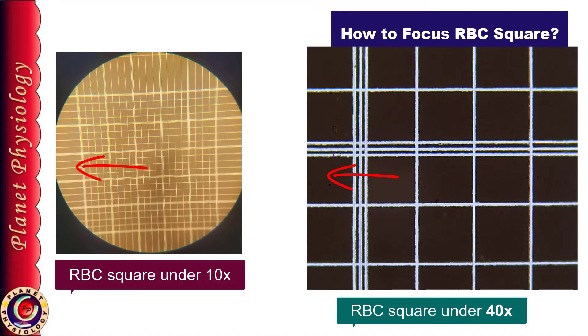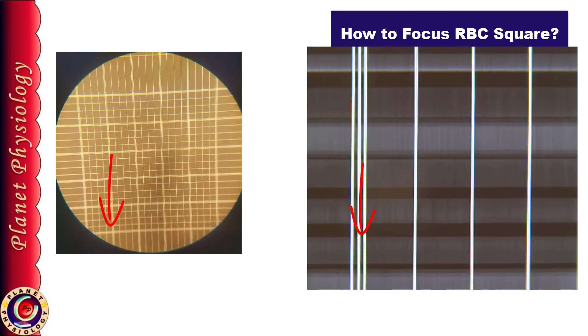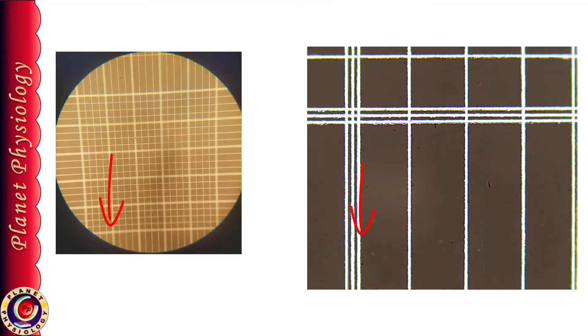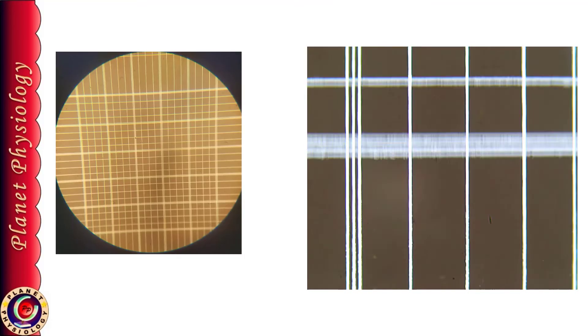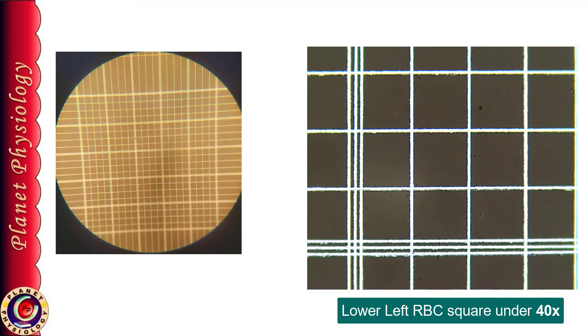So now I am moving downwards. I am getting squares, squares and now I am getting only the vertical lines. This makes sure that I am in lower RBC square.